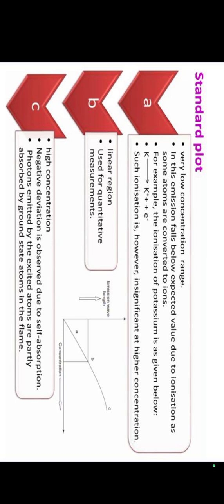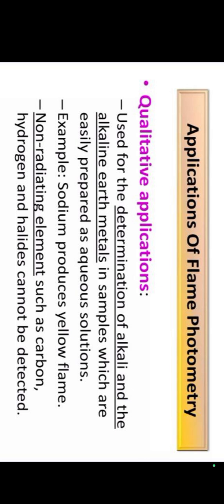And last we see the applications of flame photometry. The main applications are determining sodium, potassium, calcium, and zinc present in cement, determining the hardness of water, determining lead present in petrol, checking water quality by determining the presence of specific metal ions, and analyzing soft drinks, fruit juice, and beverages. It is also used for chemical research and to analyze soil quality.